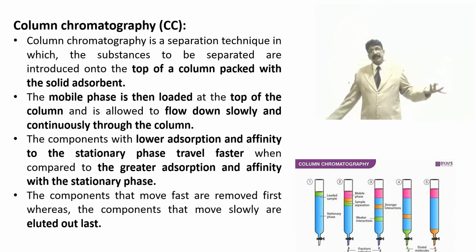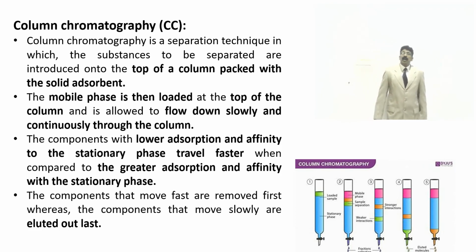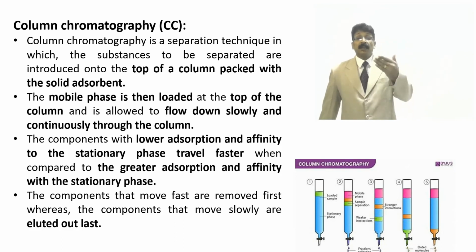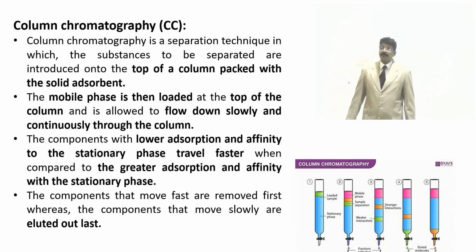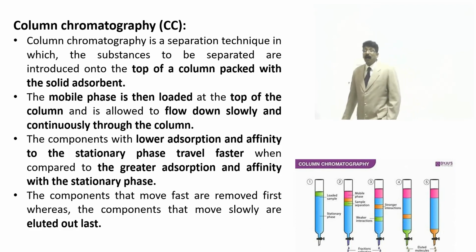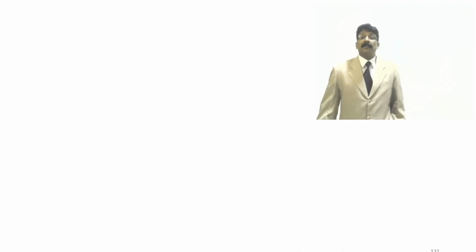That is a simple adsorption technique which we use for separation. The component with the lesser affinity will move faster and first, whereas the component with greater adsorption affinity moves slowly and is eluted out later or last.